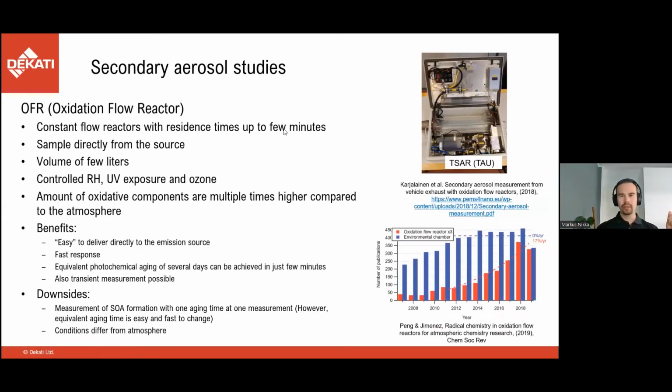The other instrument or reactor type is the oxidation flow reactor. So these are constant flow reactors with a residence time of only a few minutes.